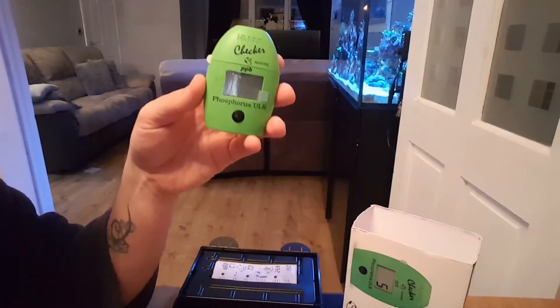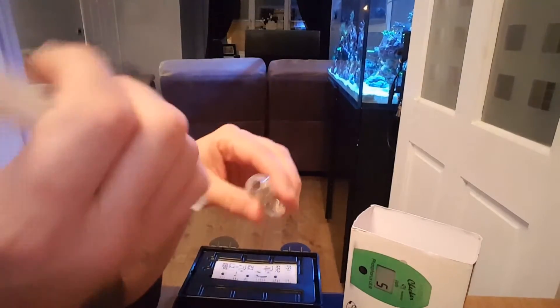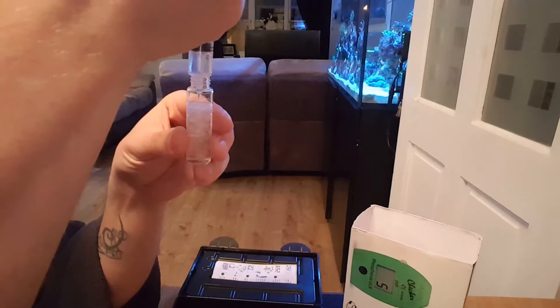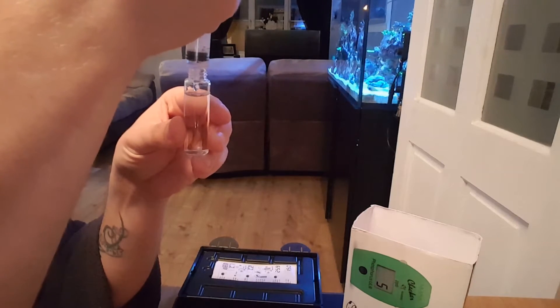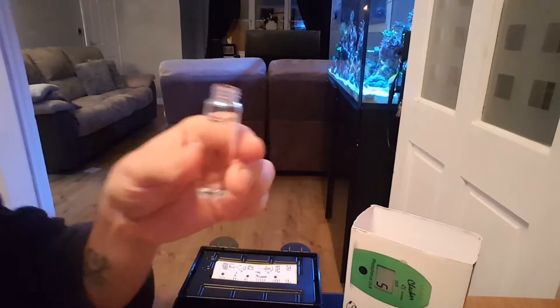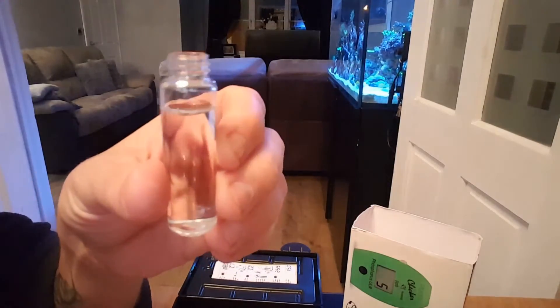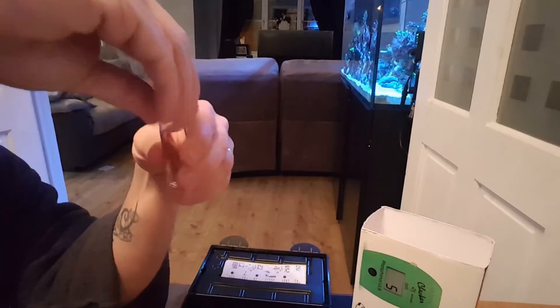So let's put it to the test. You get your vial, fill it with 10 ml of water. It does come with a 10 ml line attached on the glass. Lid on, dry the vial.